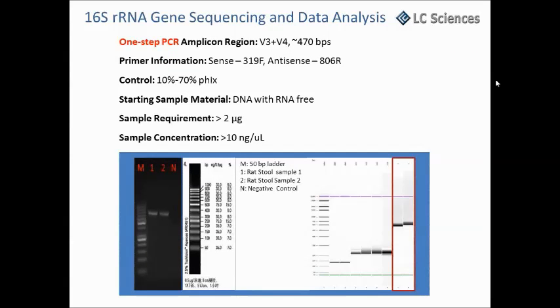Okay, thank you, Dr. King. So we continue our work. Once we have a good DNA sample, we do QC first, and if the DNA passes QC, we go further to the PCR step. As I mentioned, this is a one-step PCR instead of two steps.